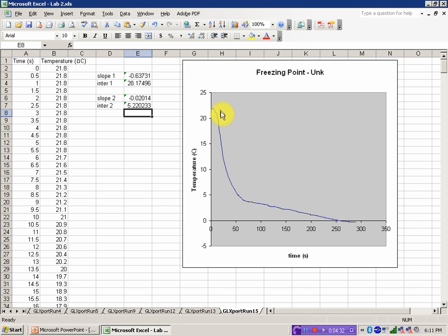Okay. The next step is going to be to add the lines to the plot so I can see what's happening. And I'm going to use separate ranges for the two of these. I'm going to add some space here. Rather than putting them on the full range as we did before, we can enter a line just by giving it 2 points. And for this first region, I want my fit area to run from a y value of about 25 down to 0.